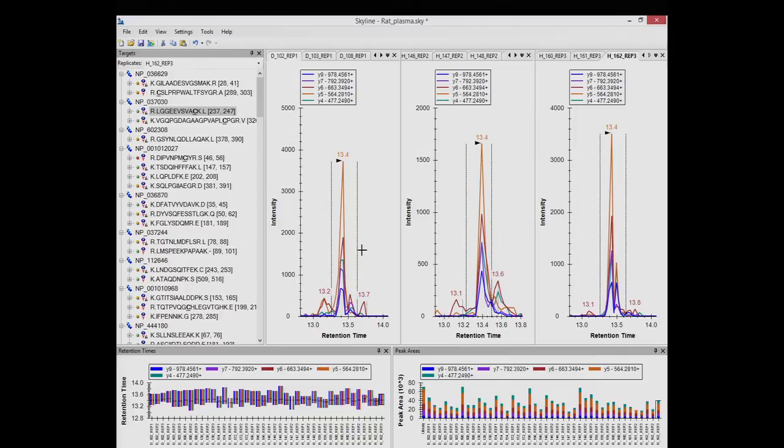Okay, so now the one trick here is that if you hadn't closed your spectral library, or you hadn't quite gotten any of these windows docked in the right place, they might have all of a sudden gotten mixed up in here. And that just means there's a difference between the windows with these tabs on the top and the windows with these title bars on the top. The ones with the tabs participate in this document area space, and the ones with the title bars are docked around the edges of that. And so hopefully everybody's looking like this. I'm now just going to come and take a quick look at all of you.